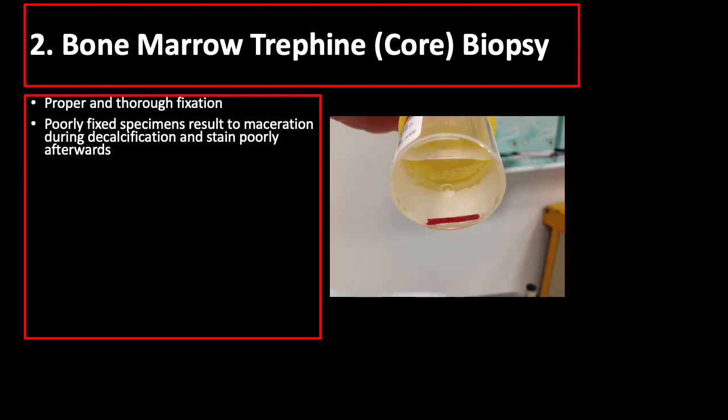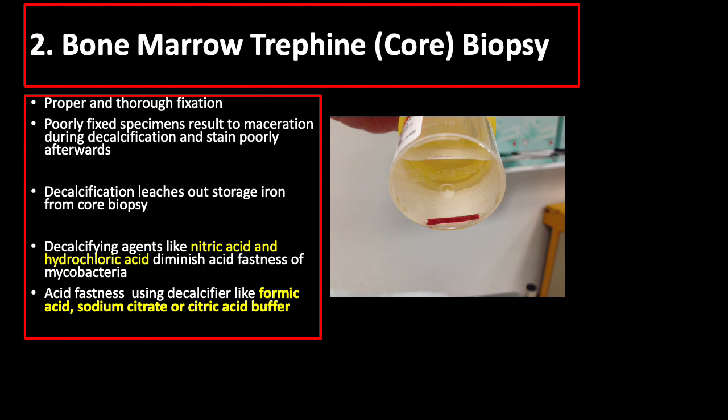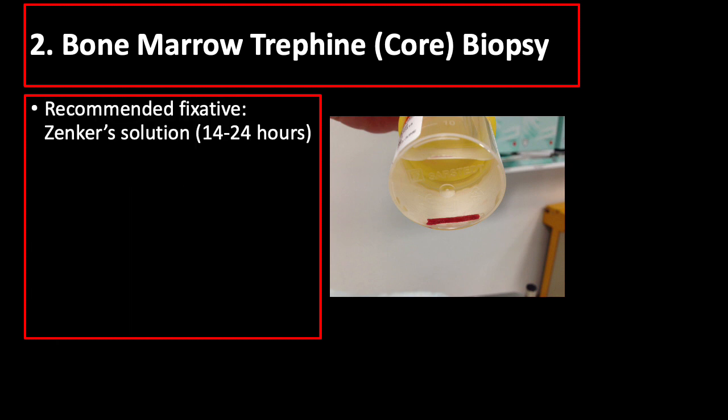To protect cellular and fibrous elements of bone from damage caused by decalcifying acids, it is important to thoroughly fix specimens prior to decalcification, as poorly fixed specimens become macerated and stain poorly. Decalcification results in leaching out of some storage iron from the core biopsy. Decalcifying agents like nitric acid and hydrochloric acid diminish the acid fastness of mycobacteria, resulting in false negative results, while acid fastness is retained when decalcification is done in formic acid, sodium citrate, or citric acid buffer. For bone marrow biopsies, Zenker solution is recommended for fixing, decalcifying tiny bony spicules over 14 to 24 hours.